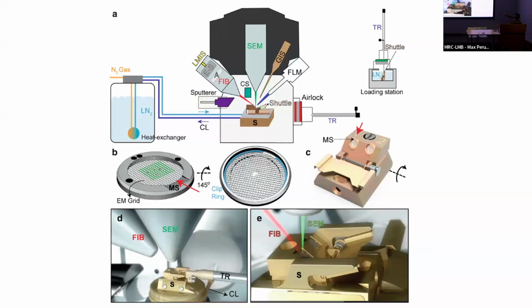This is what it involves. The SEM has the electron image, and you have a focused ion beam. I don't know what kind of ion we are using now. It was gallium, and now it's argon or xenon, depending on what kind of source you use. The high-energy beam will cut the cell and make it thinner.